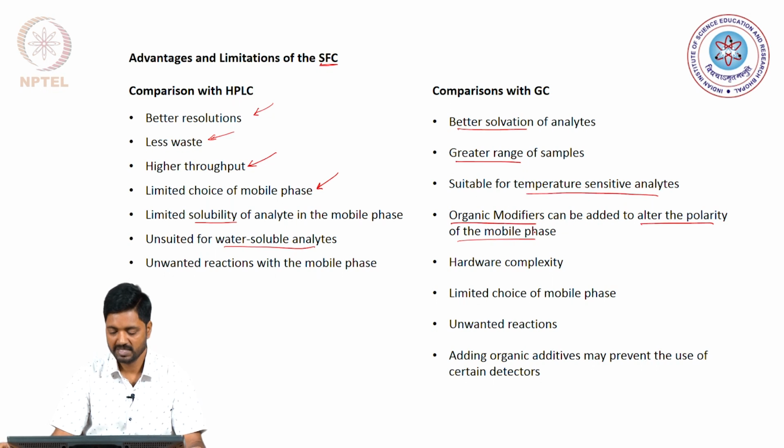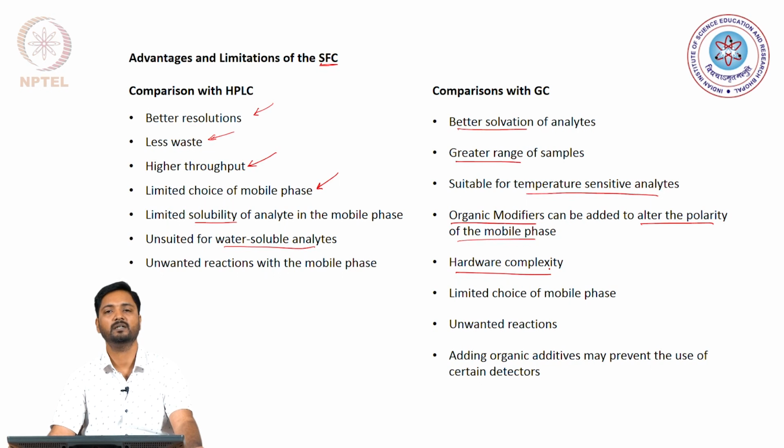However, the challenge that needs to be overcome when using supercritical fluid chromatography is the hardware complexity, and this aspect needs to be explained in detail. Now, we have realized that all the properties of supercritical fluids are very sensitive to changes in temperatures and pressures.